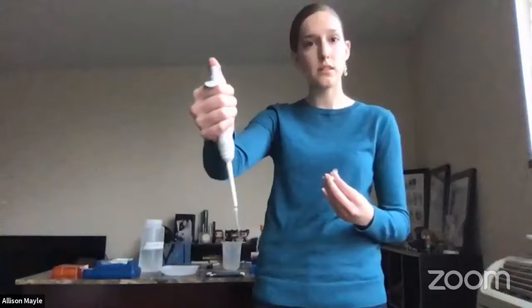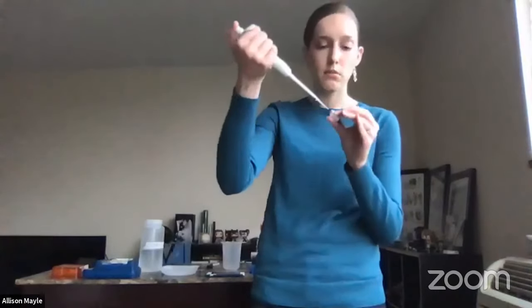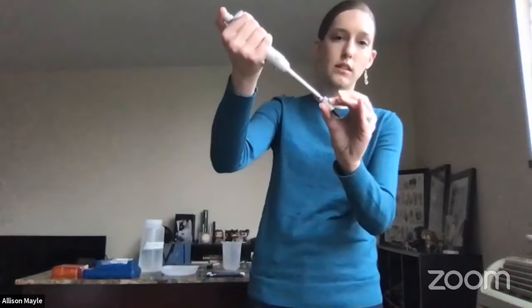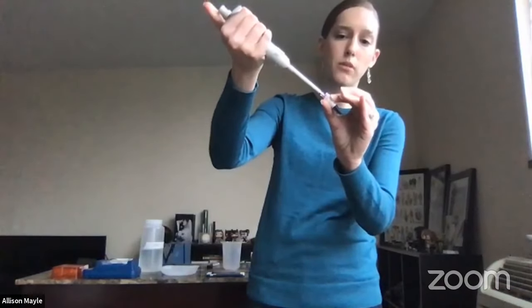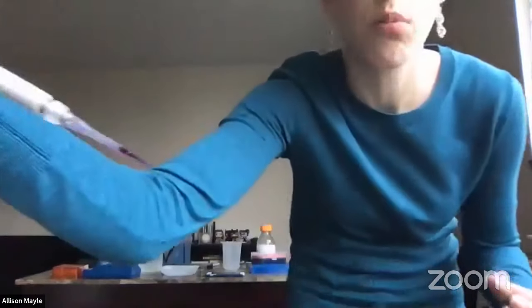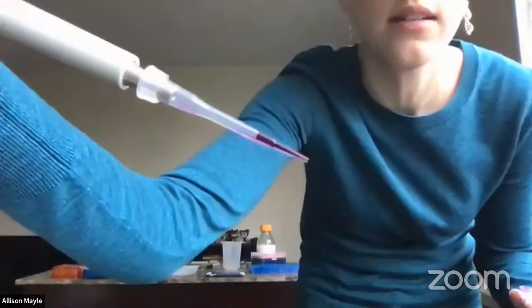Okay, so I'm gonna press down to the first stop. Then I'm gonna put my pipette tip into the liquid, and I'm going to release my thumb upwards, just like releasing the bulb. And then what you can see is I have this little bit of purple liquid in the end of my pipette tip.